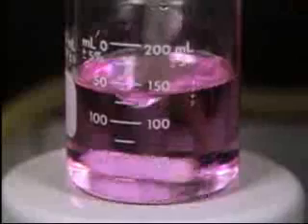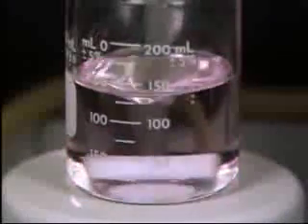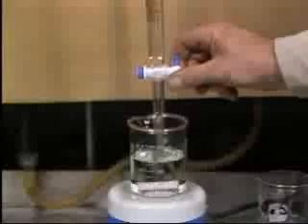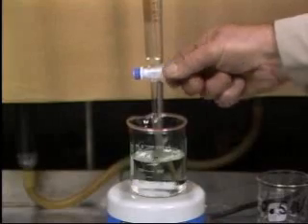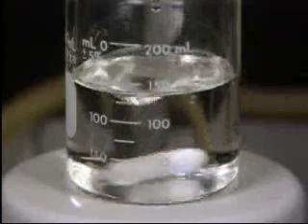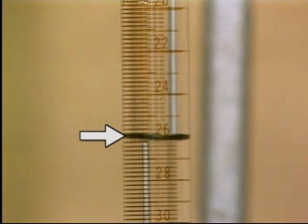When all traces of the color produced by the indicator have disappeared, the reaction is complete. The alkali in the sample has been neutralized. As soon as the color of the sample changes completely, the valve is closed all the way. Now the amount of acid required to neutralize the alkali can be determined. By checking the level in the burette, you can determine how much acid was used. In this example, 26 cc's of acid were used.